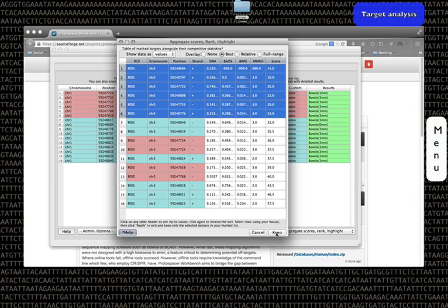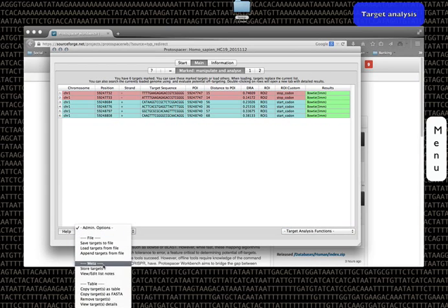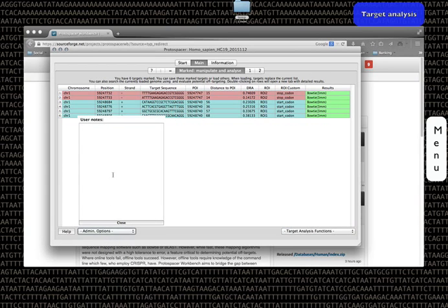Now that I have 6 good candidates, I want to write a note on them. You can put any descriptive data that you'd like into a note. It's especially important if you want to share your saved list with a colleague. The colleague will need to read the notes and understand why the targets are important.